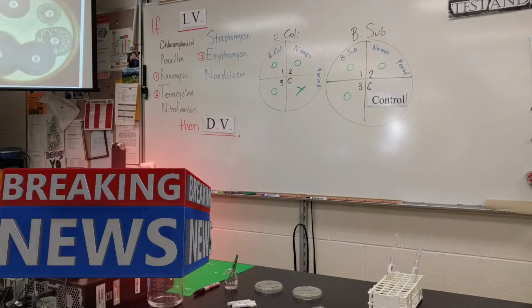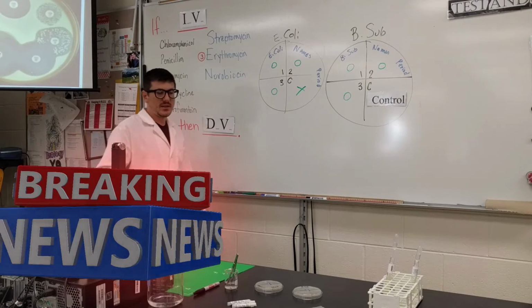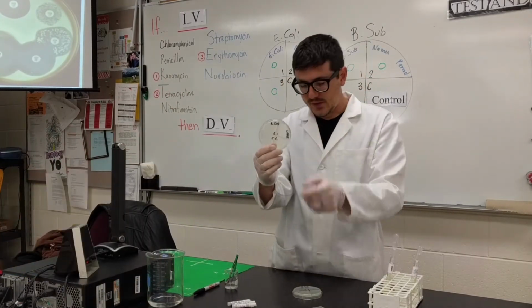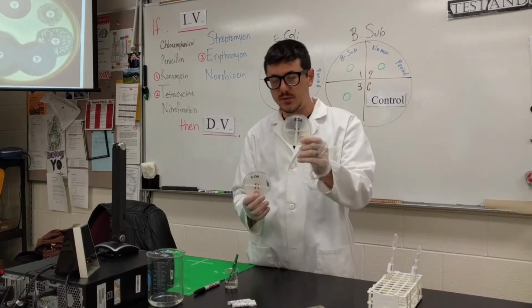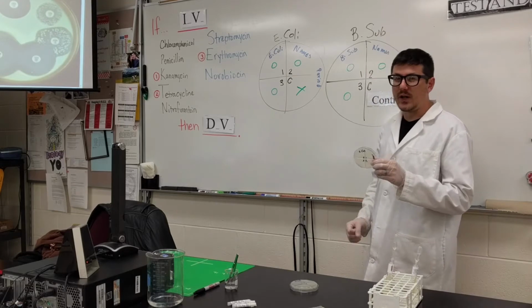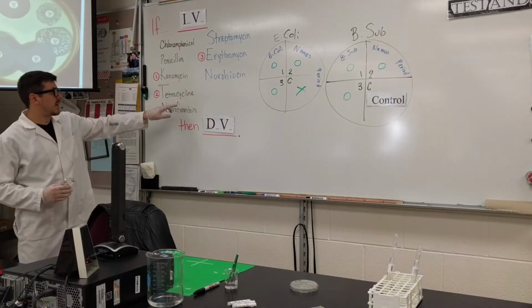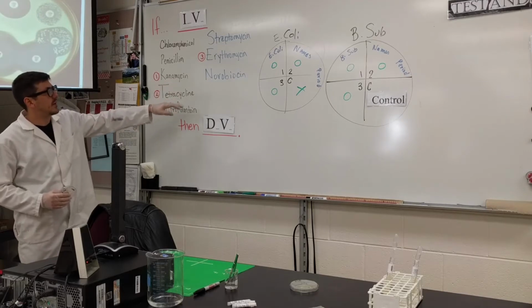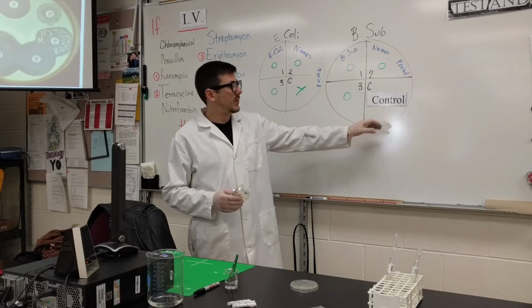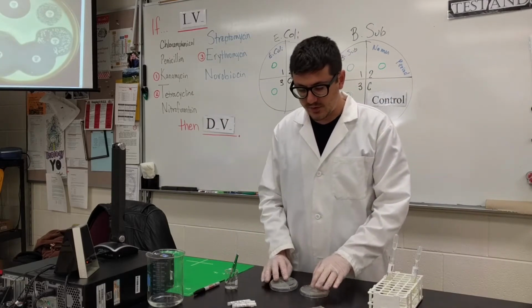Welcome to our antibiotics lab. Now, we picked 3 antibiotics, we labeled our plates, and I'm ready to start. So on my petri dish, I have 1 for E. coli, I have 1 for Bacillus subtilis. I have them labeled 1, 2, 3 for my quadrants. Each part will have a specific antibiotic. I picked kanamycin, tetracycline, and erythromycin. We're going to leave the last open as a control, so we're not going to have any antibiotic here. We're just going to test to see that we can successfully grow the bacteria there.